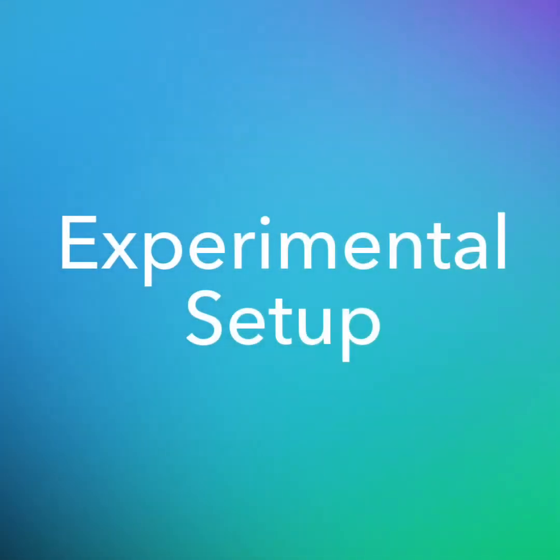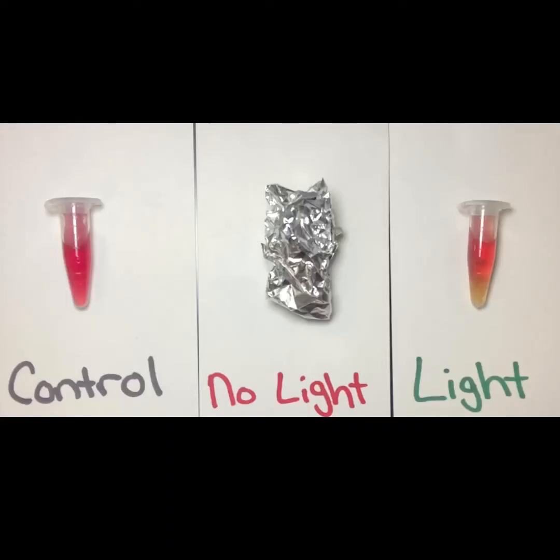For this experiment, I filled 3 microcentrifuge tubes with approximately 0.7 milliliters of water. In 2 of those tubes, I placed around 6 algae beads. In all 3 of those tubes, I placed approximately 5 drops of the bicarbonate indicator solution. So now I have my experiment set up.